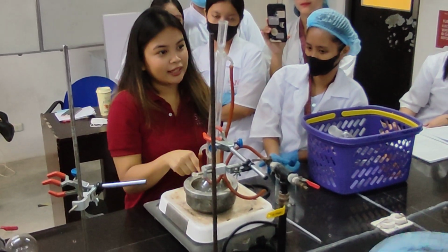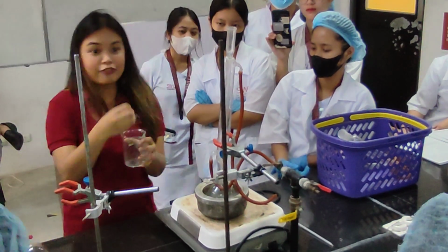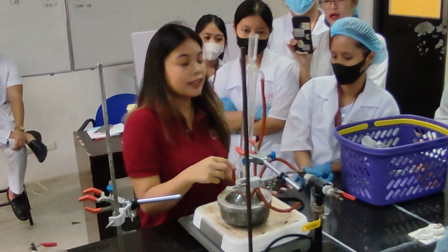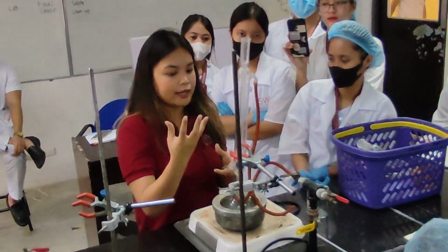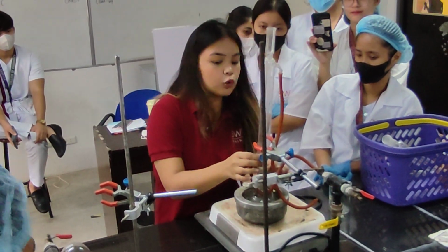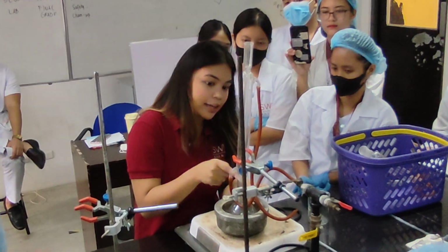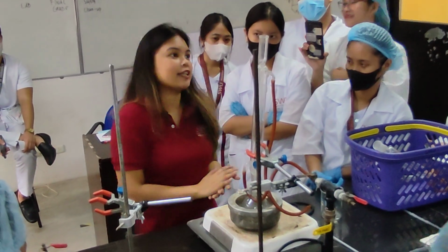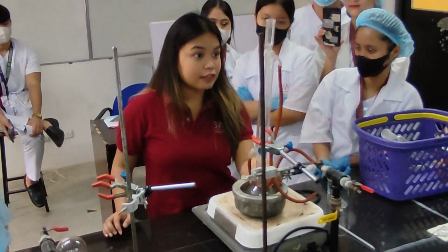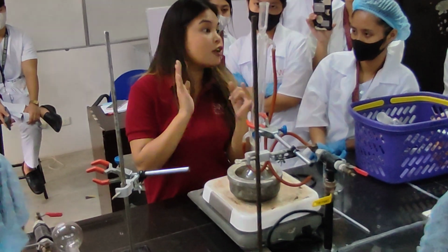It goes back to liquid, so you are reusing your solvent. Unlike here, where it evaporates, now you maintain your solvent, so it is not lost. That is why you need to keep this very tight, because you don't want the vapors to go outside. It should go straight back in. So the purpose of reflux heating is to reuse, to recycle the solvent, because you want to check the complete reaction of your solute and solvent.